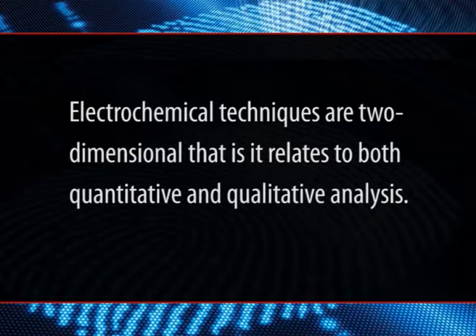Electrochemical techniques are two-dimensional in the sense that they relate to both quantitative as well as qualitative analysis. These methods are used to solve problems related to the pharmaceutical industry with a high grade of accuracy, selectivity, sensitivity and precision.